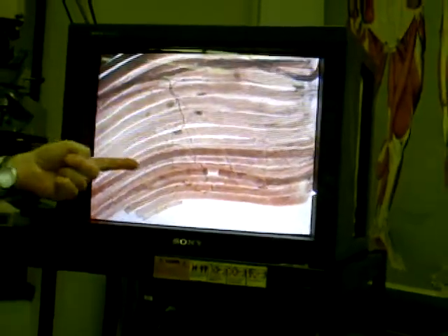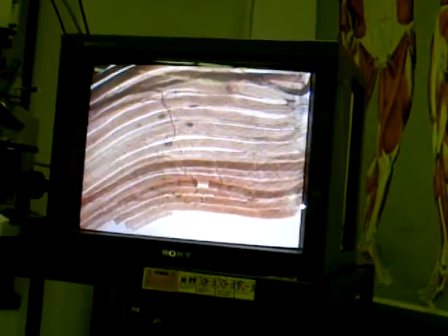So this shows you very clearly the interface between the nervous system and the musculoskeletal system. And remember, there's not even anything remotely equal to a whole cell there. These are just small parts of very, very, very big cells. Striated muscle cells and motor neurons are very large cells. Not like the typical epithelial cells and other cells that we usually look at.